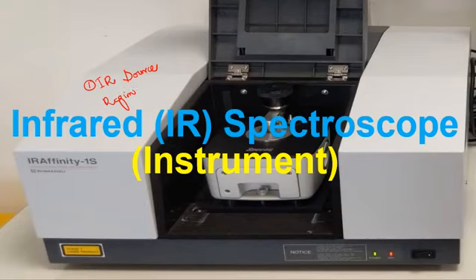The second part is known as the sample holding region. The third part is known as the IR detection region.